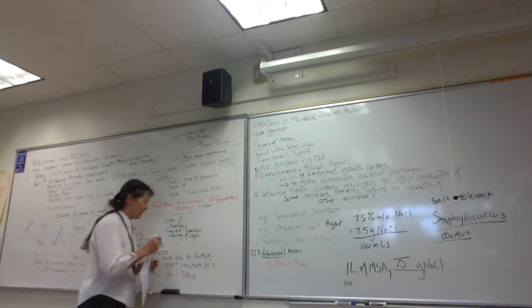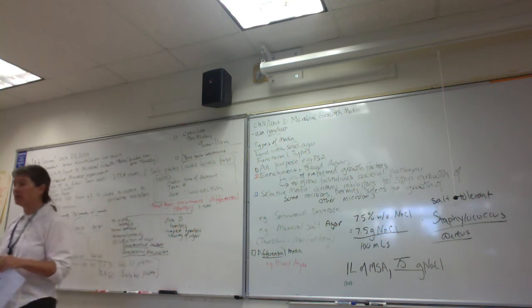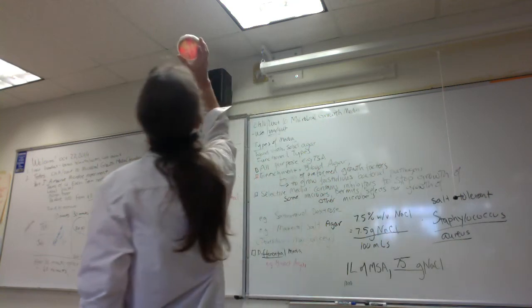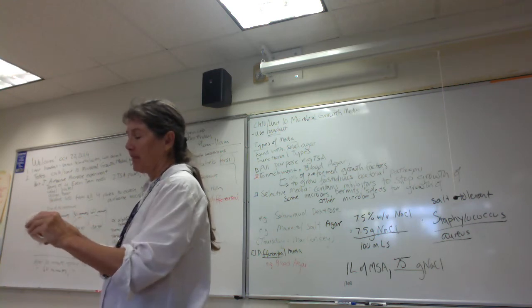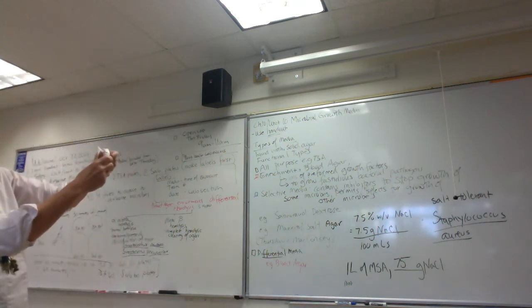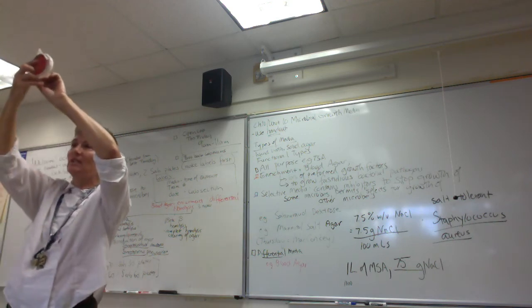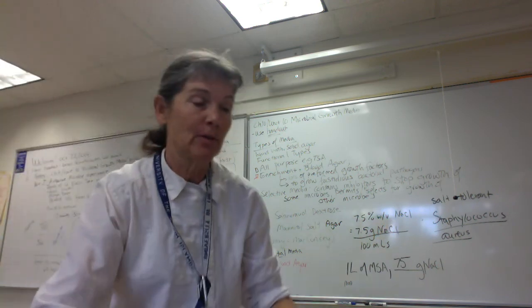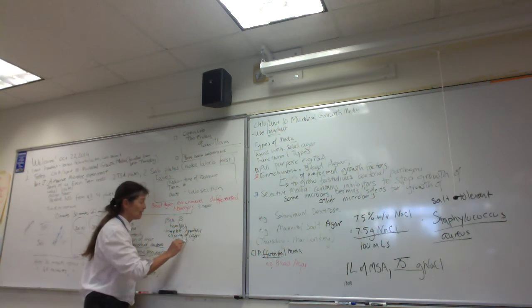And there are 3 really important bacterial pathogens that I'd like you to know that are beta hemolytic. And we might, I'm not sure, we might have to do some follow-up here. We might have one of them on this plate. And you guys, I know this is going to be hard to see because we don't want to open these, right? Because we're amplifying pathogens now. But on this one throat sample, if I backlight it, can you see how there's areas that are extreme clearing almost? I mean, you see the greening, right? But you see how the agar is even lighter there? That might be beta hemolysis. And if we're getting beta hemolytic colonies out of a throat swab, our prime suspect is Streptococcus. Anybody you want to guess?